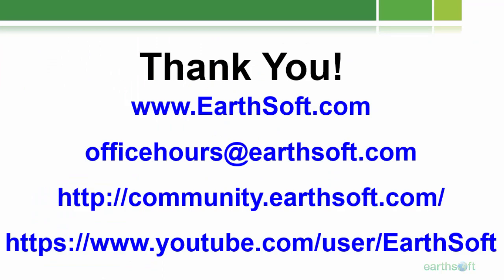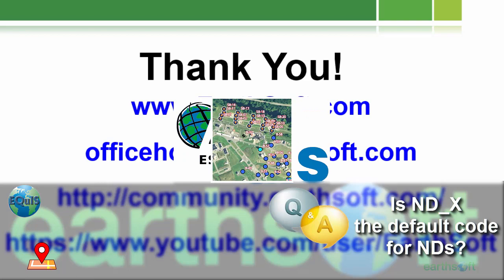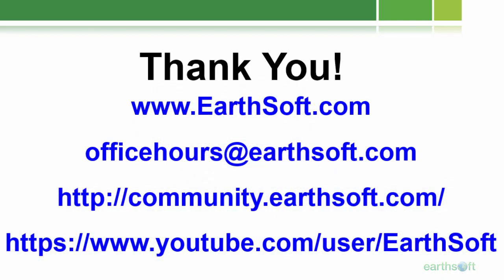Awesome. Thank you so much, Isarna. I do have a question from Ping, and the question is: is ND_X the default code for non-detects in that comparison value? It is, yes. That is a hard-coded value, and so it needs to match exactly. Excellent. And that's in the documentation as well, right? Yes, it is. Good deal.